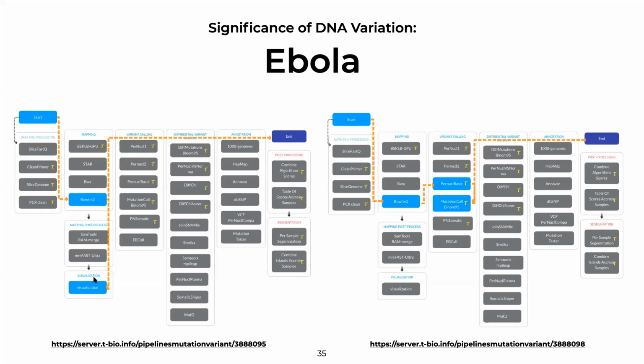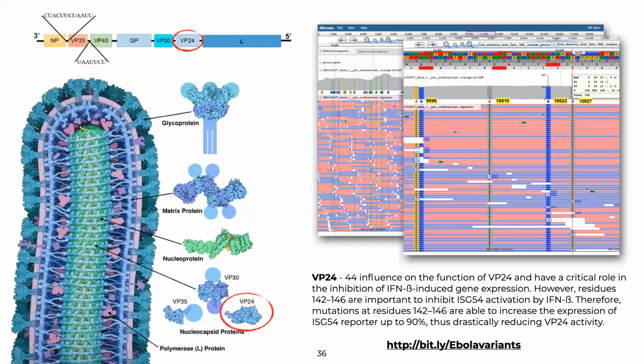So as we will cover in the program, we'll talk about the process of taking those same mutations that you can see that we visualized, and then doing some statistical analysis for variant calling and characterization of the genomic variants to be able to identify the mutations that are most significant. As you can see right here, this is the actual Ebola sequencing data that were later on used in the proteins that were included in the testing of the vaccine that was designed for the Ebola virus.